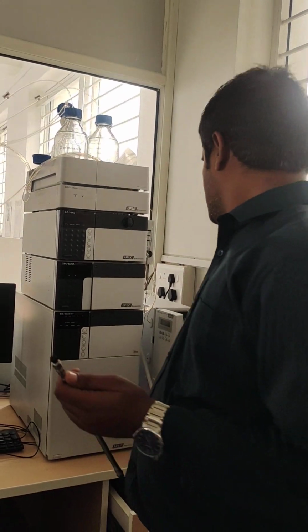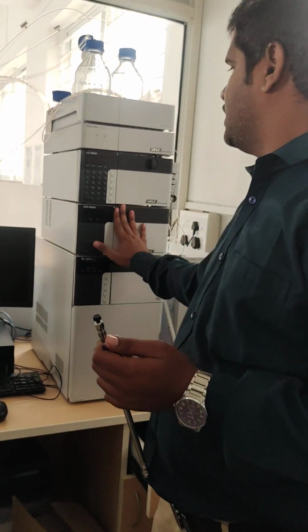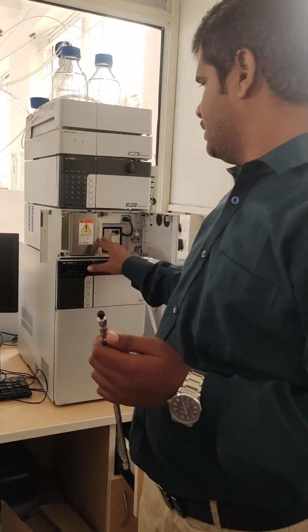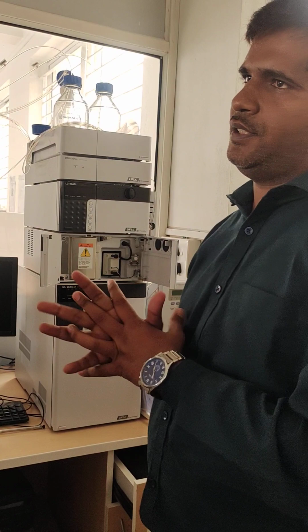Correct. Now I hope you are understanding this column compartment section. After the column we have the detector. What is that? Detector. Inside the detector a cell is there, and two types of detector can be used in HPLC. One is the solute property detector, another is the solvent property detector.